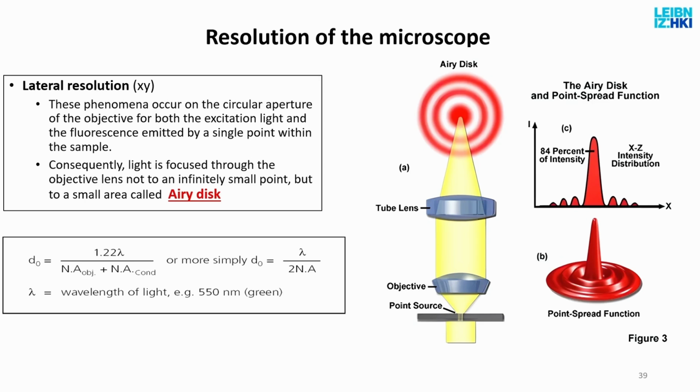So what does this mean? This means that I still know more or less where the object is. It's at the center of this distribution of intensities. Do I know how big it is? Not really. The pattern itself depends on the size of the object and the wavelength. So I can guess, but I don't know exactly.